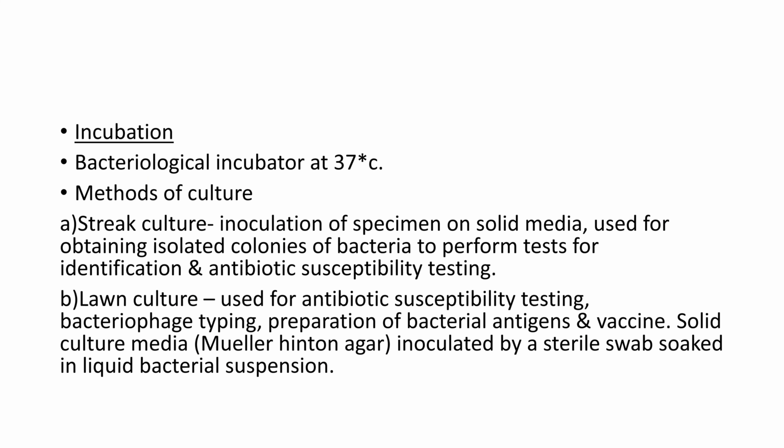After applying the antibiotic disc on Muller-Hinton agar, it is incubated in a bacteriological incubator at 37 degrees centigrade. So right now we are discussing the methods of culture. Culture methods can be of different types. First is the streak culture.